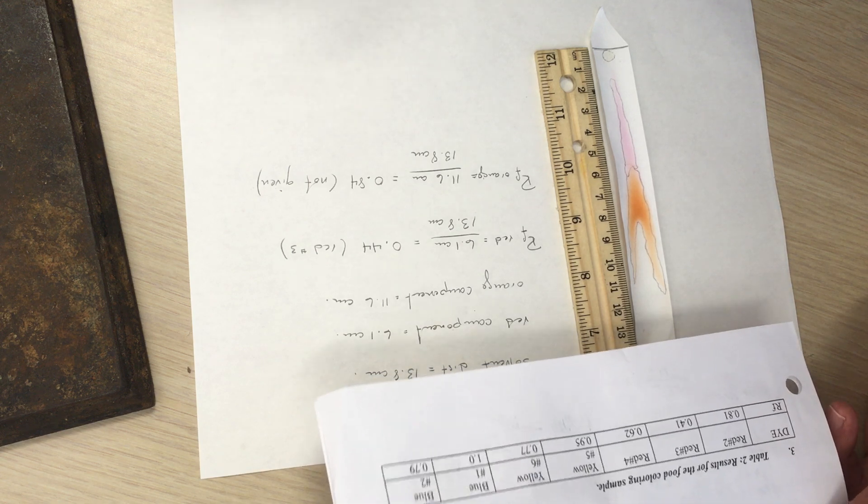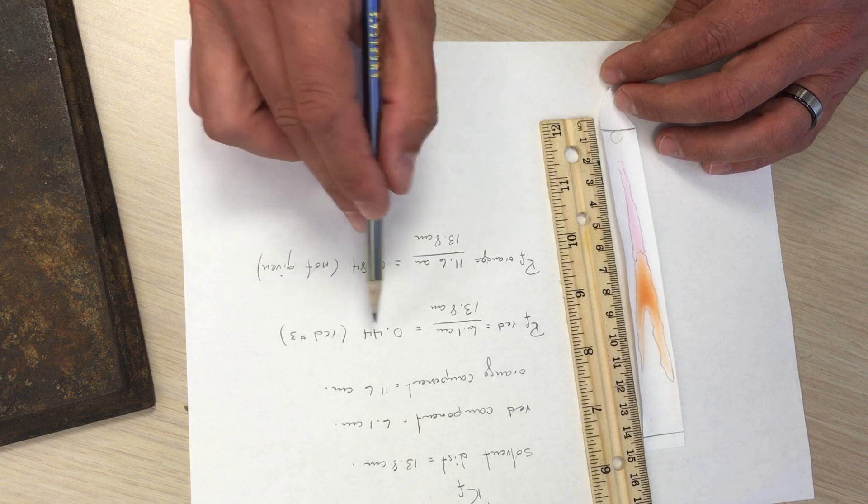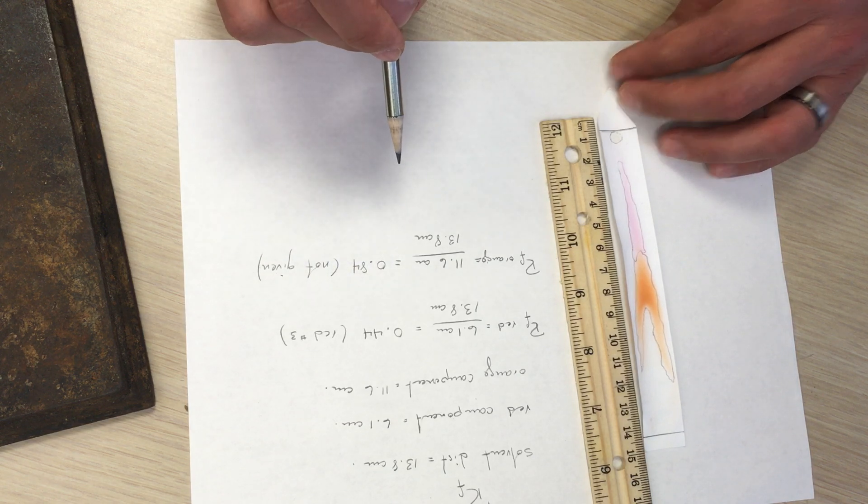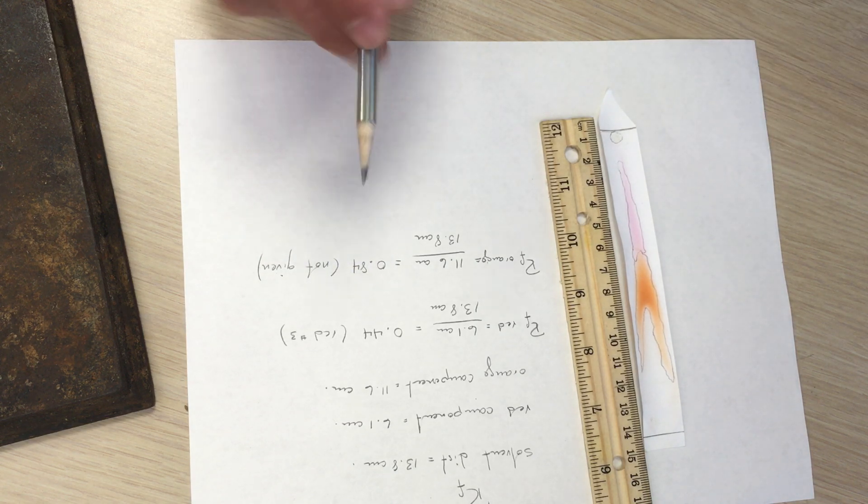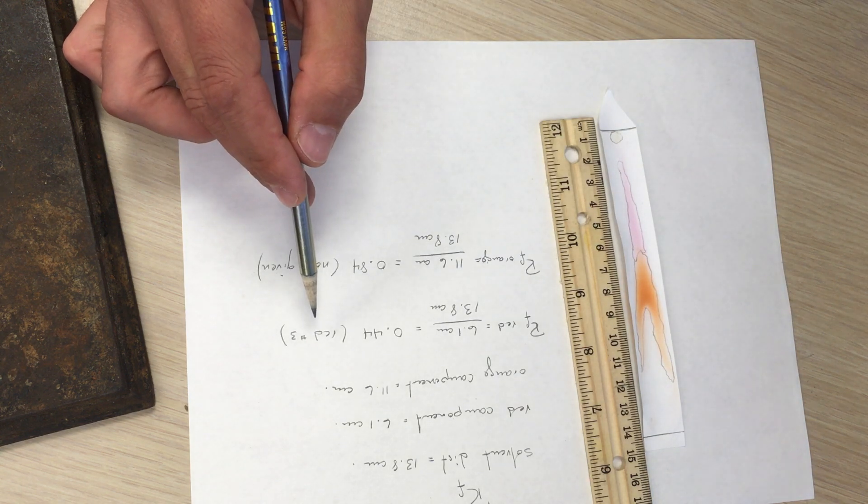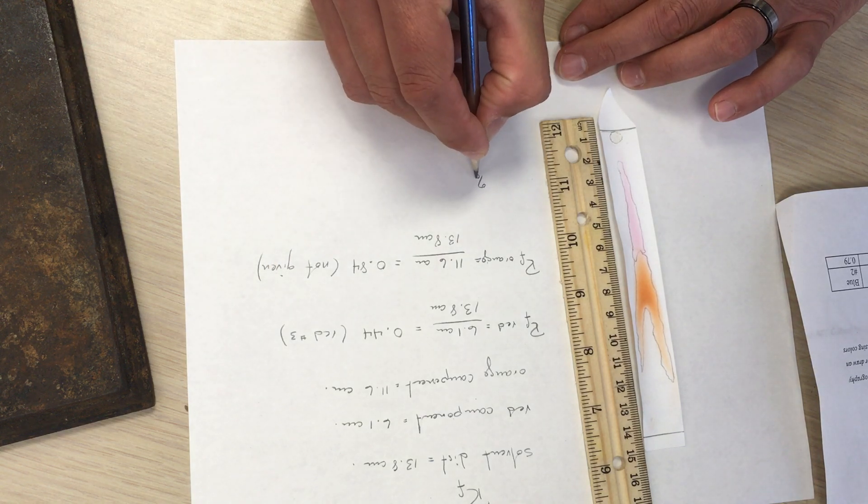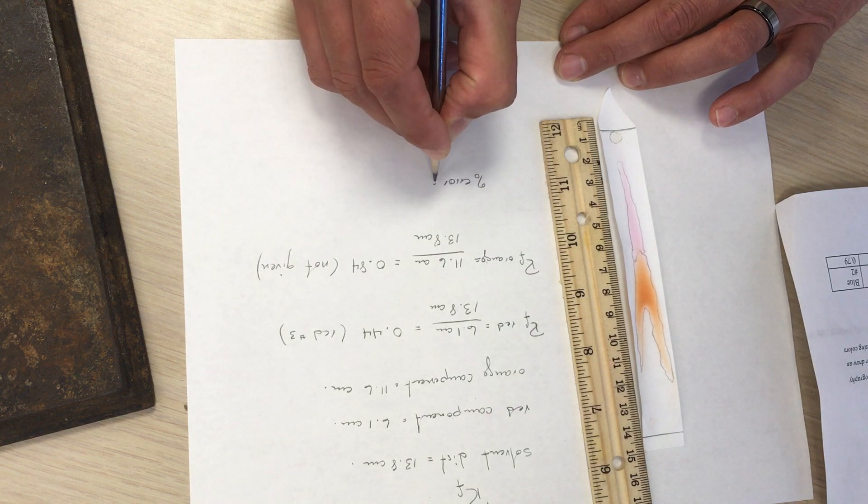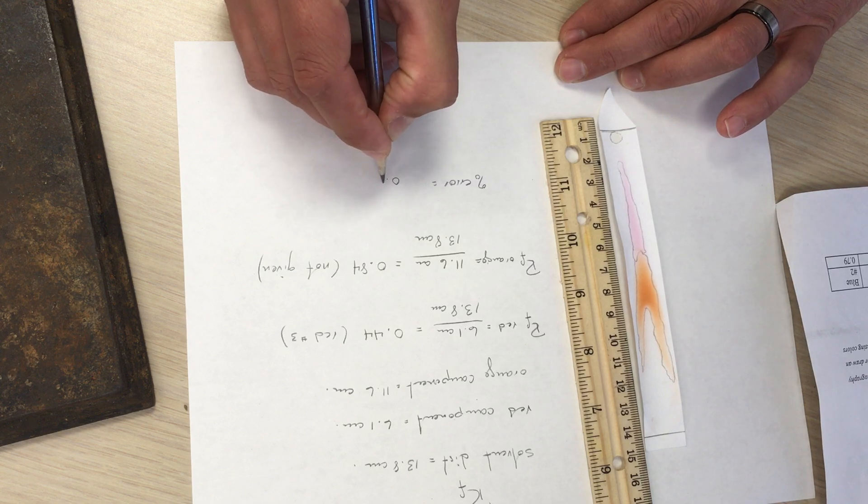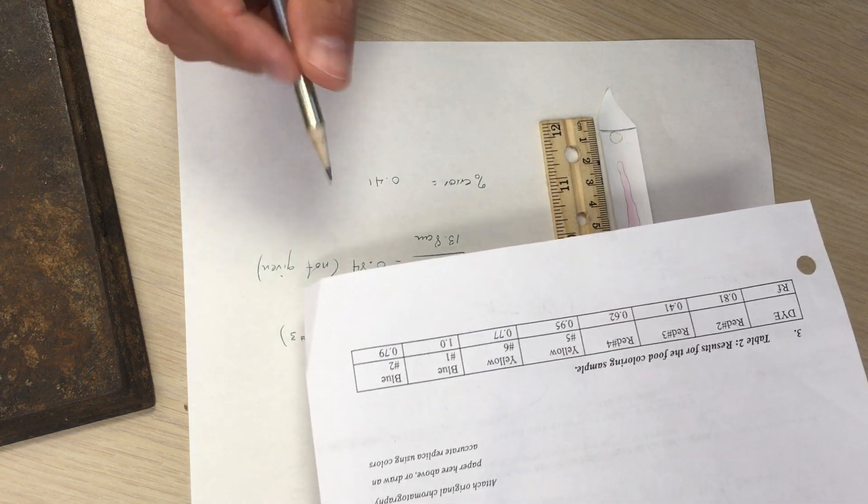So we can calculate how far we are off the red number three by calculating our percent error. And to do that, we're going to use the expected value. Assuming that it is red number three, we would have expected a value of 0.41 as given on the sheet here.